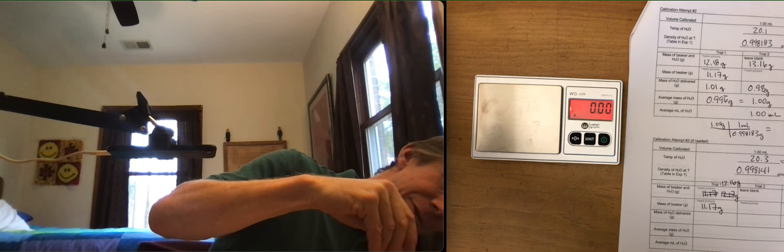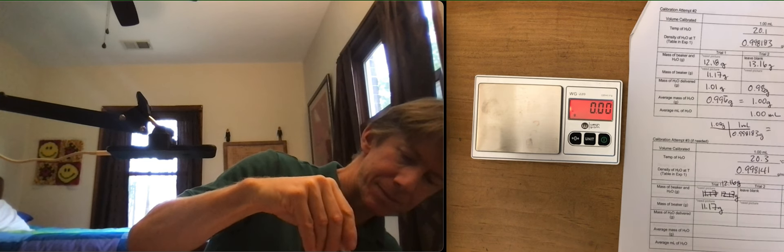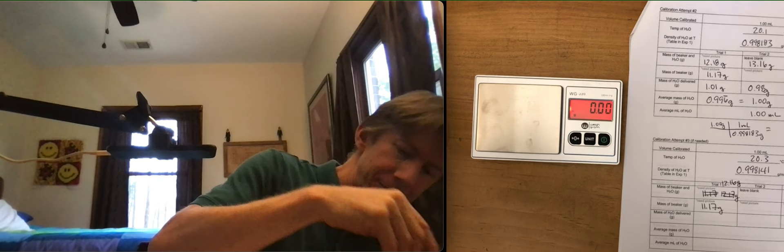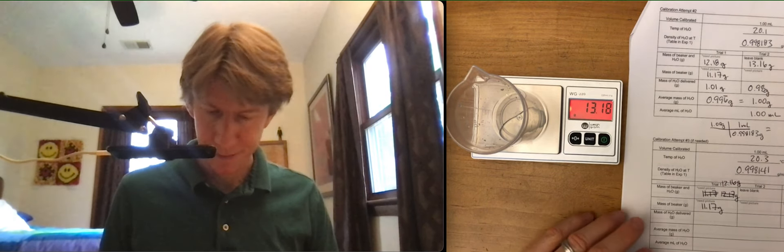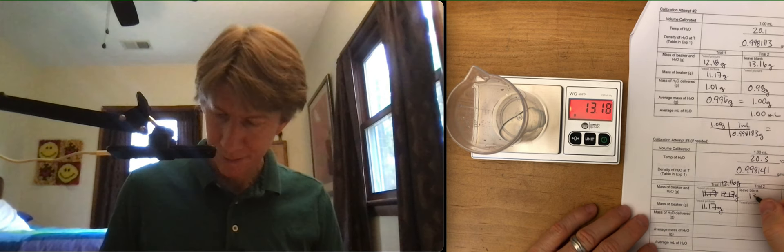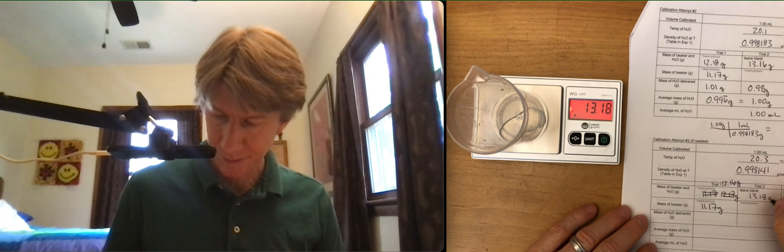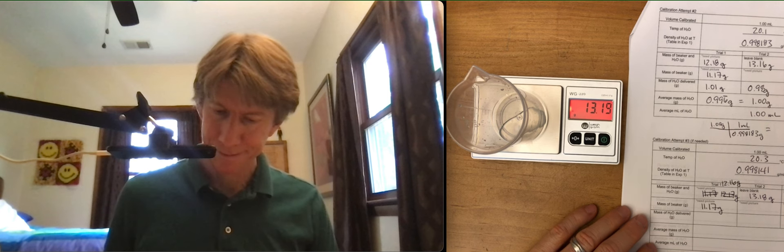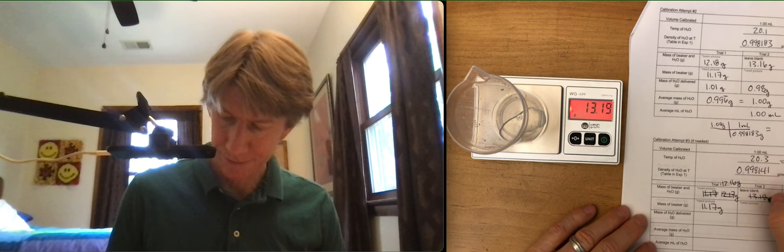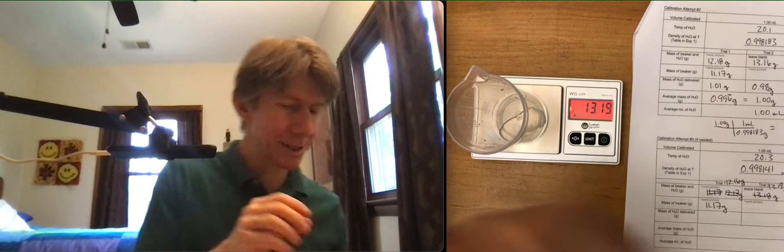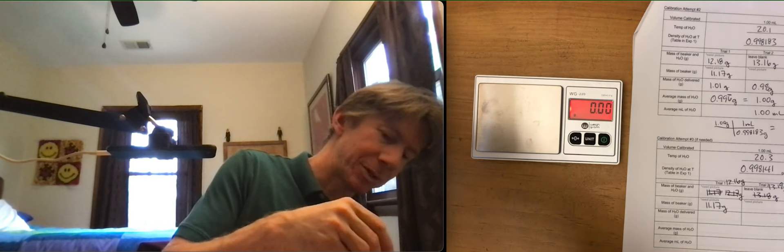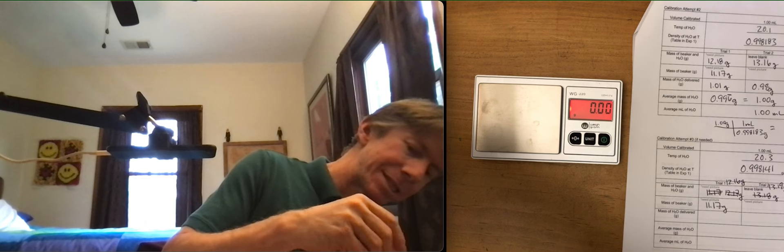My pipette, are you my friend? Okay. Now you went up. 13.19 grams. Okay. Call them as I see them, as they say.